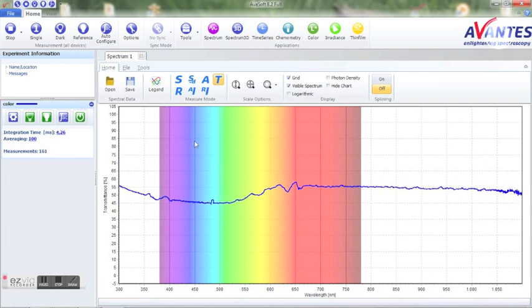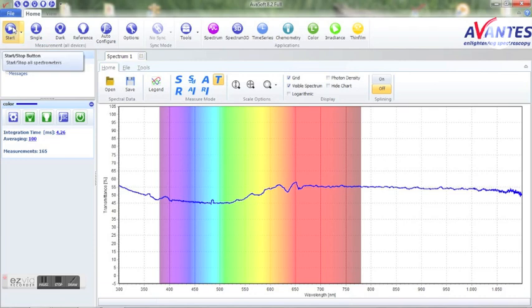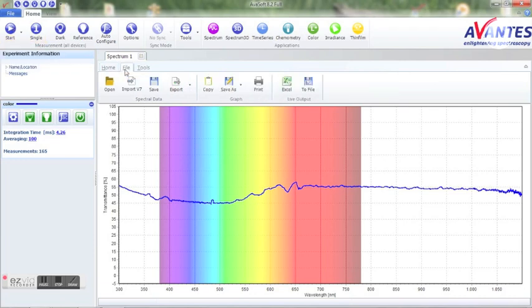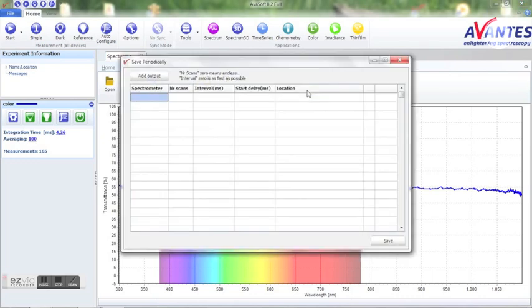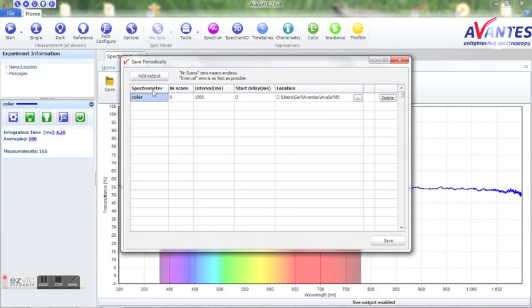Stop the measurement and go to the file tabular in the spectrum window. Select live output to file. A window will open. By choosing add output, you can select the spectrometer from which you want to record the transmission spectra.